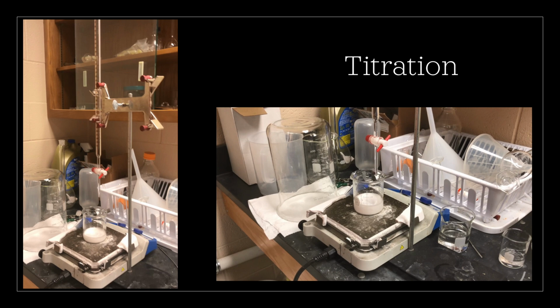In order to calibrate the concentration measurements to a system with propionic acid, aqueous samples must be collected at the bottom of the column at different steady-state extract concentrations. In our lab, these samples were titrated, and the concentration determined by titration was plotted versus the concentration on the display to determine the factor by which the concentrations on the display were inaccurate.